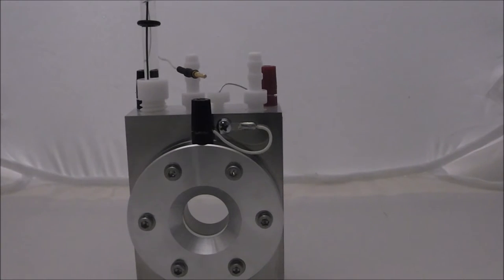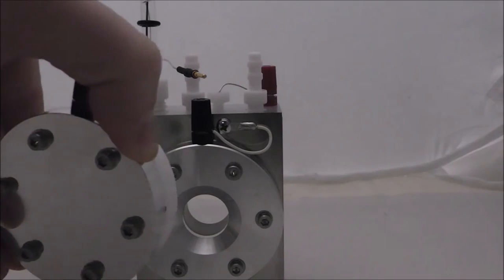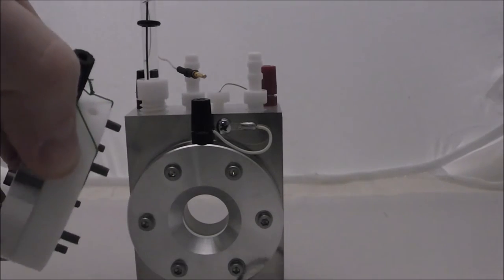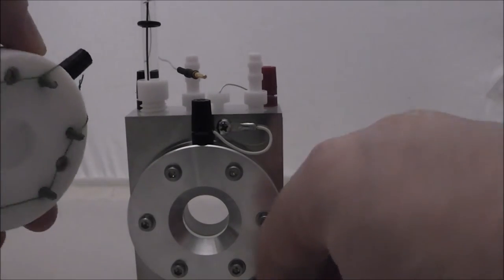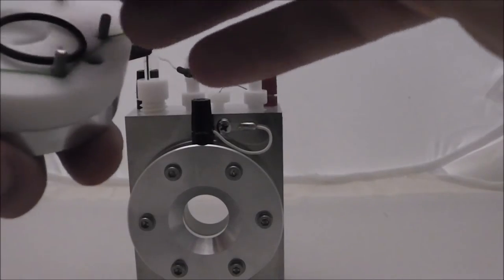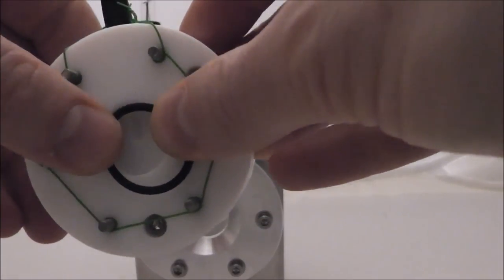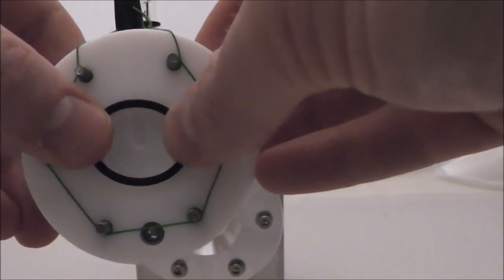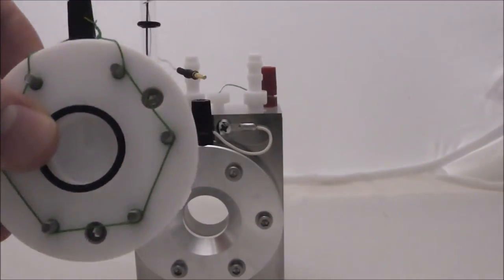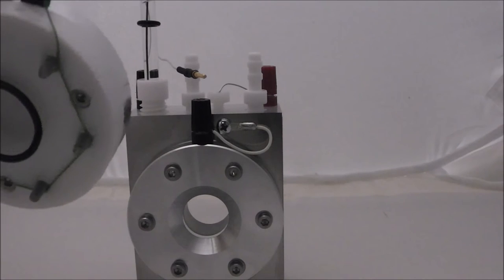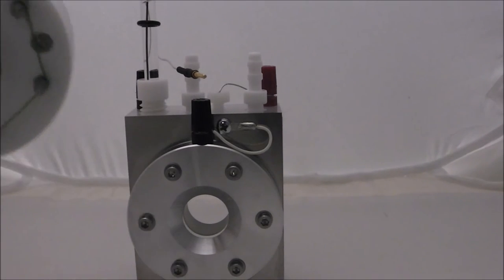When you order the PEC2 cell, they give you another version of the cell so that you can run it in pure transmission mode as well. If you don't want to shine light all the way through, or you only want light to be emitted on one side, then you can have this non-transmission cell or non-transmission adapter.